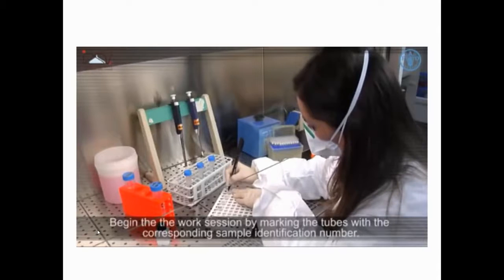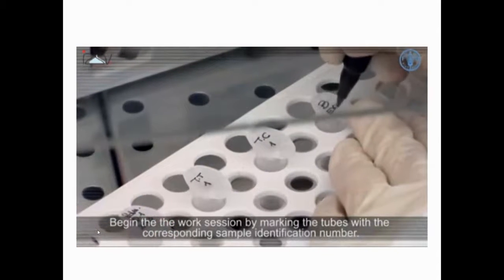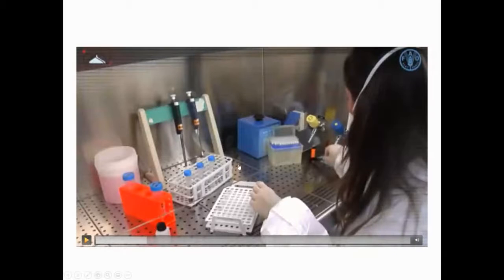Begin the work session by marking the tubes with the corresponding sample identification number. This step is the most important step, okay? You have to always label the tube so that you can identify which sample is in which tube. If in this step you mislabel the tube or you skip this labeling, then you will make the whole procedure meaningless because you don't know what is what sample.